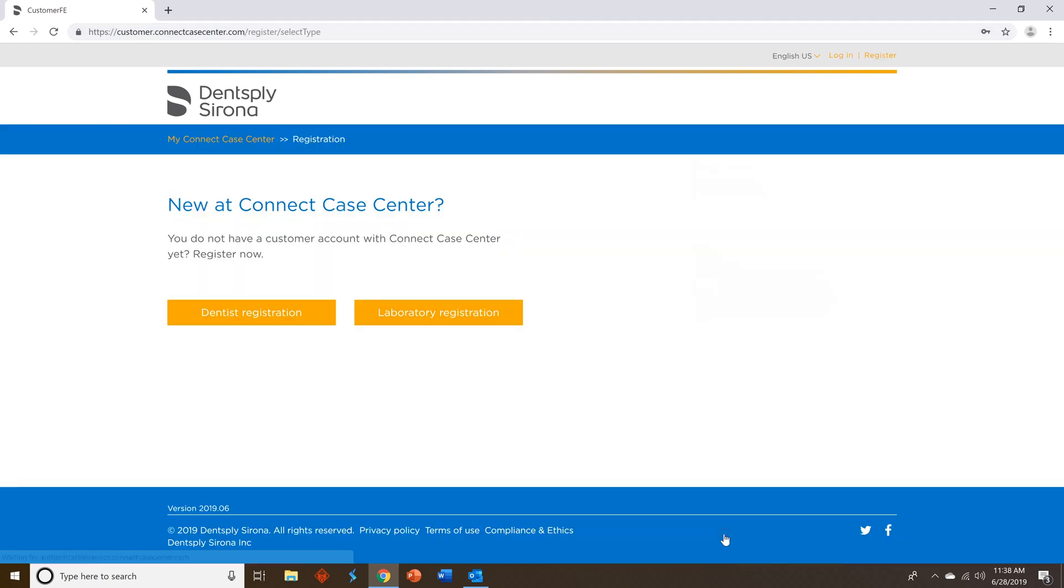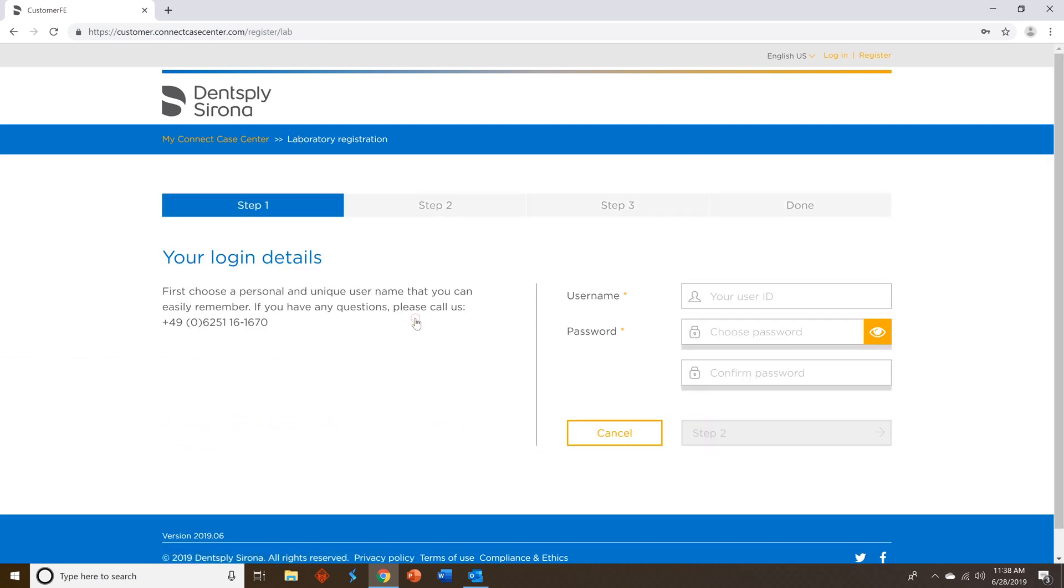You will then see new to Connect Case Center. Select laboratory registration and then create a username for yourself, a password, and once you've completed that, you can move on to step two.